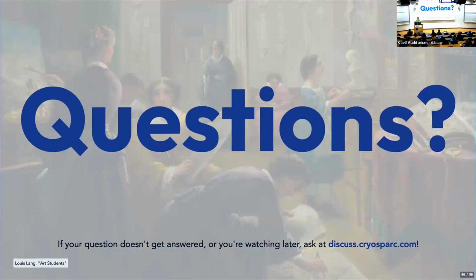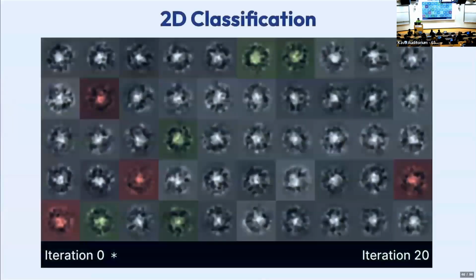You've already filtered out a lot of junk that doesn't even have the rigid part. So generally, I'd recommend using 3D, then volume alignment tools and re-extract. I think there's material in the guide for that as well. Yeah, thanks. Okay, like I said, any more questions? We'll do them at the end for sure.